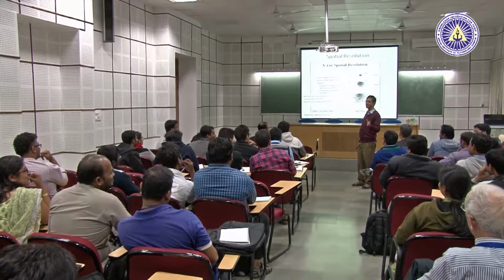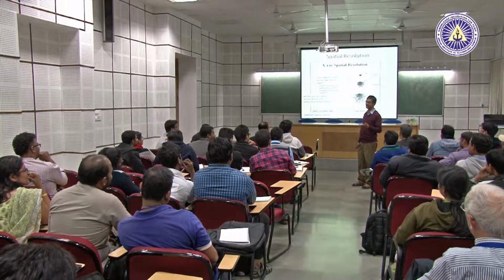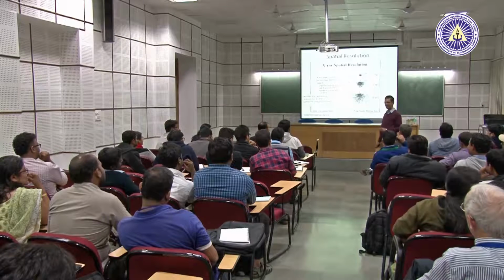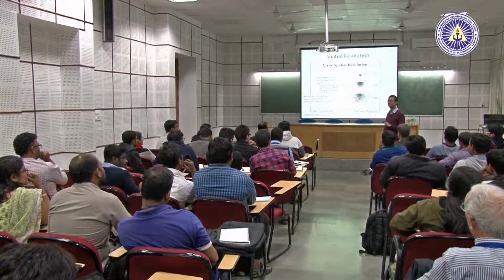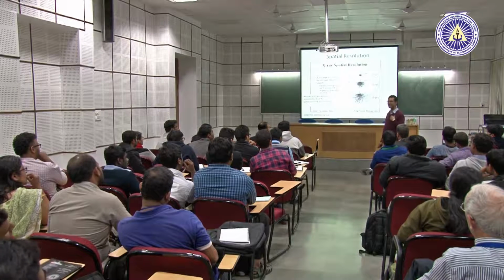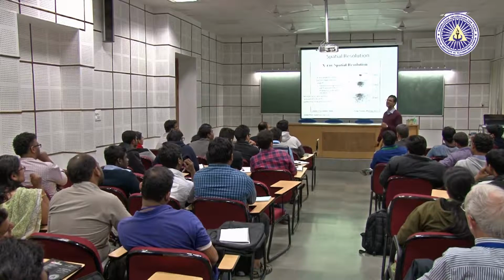It's like jumping from a moving train. Exactly the same thing. They will let us jump to the shell. But the electrons do not really jump to the shell. By the way, do you know how they move? Any idea? These are all terms we use, and in the actual sense they are incorrect.